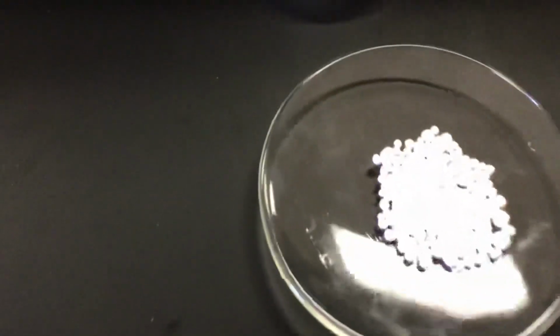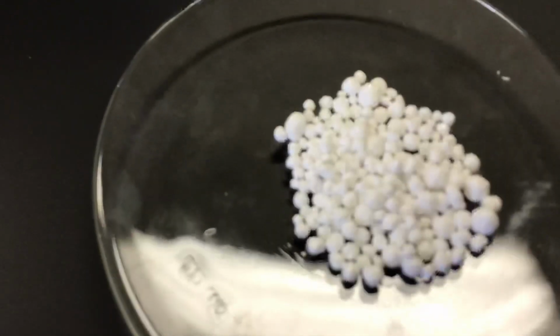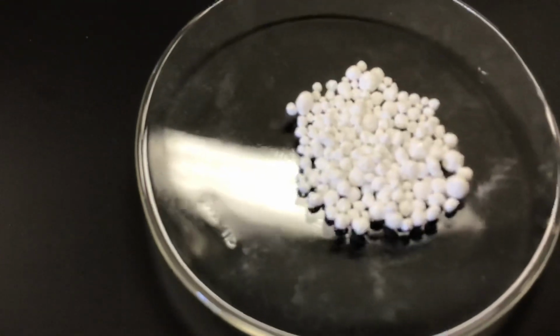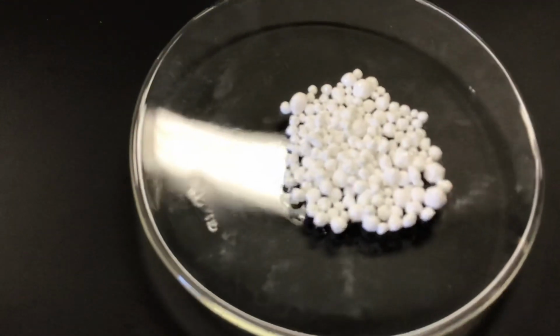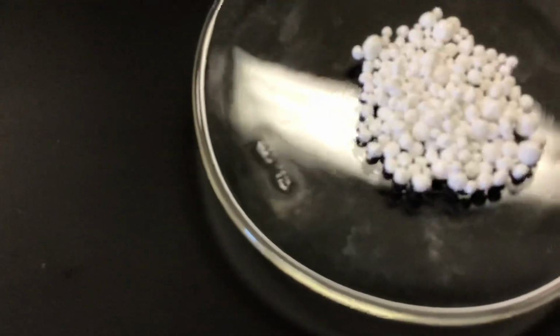All right, so here is calcium chloride. I'll try to get it where it's not so blurry. So what color is this? What do you think it looks like? Pause the video if you need to write stuff down. All right, moving over to the next one.